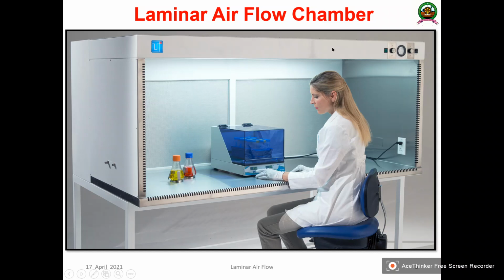So this is the chamber. You can see this researcher is working. Inside this chamber there are media and plates and all those things. You can see this is a sterile cabinet, in front of which we can sit and work, and you can do all inoculation work and media pouring and all those things. You might have seen your teachers working in it on some occasions.